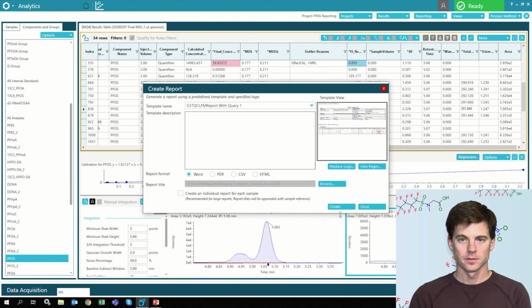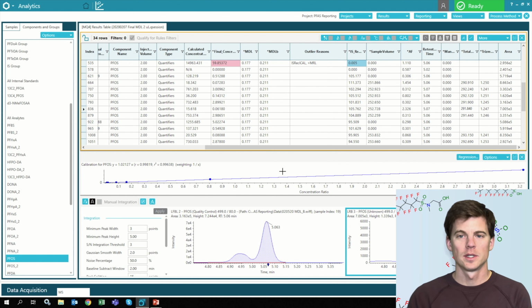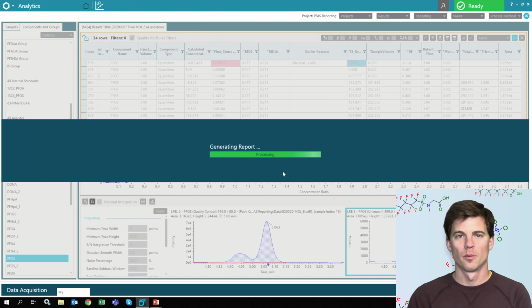And then again, anything in the batch that you typed in, anything calculated here can be pulled into further reports downstream. So I used a report template here. I just clicked create report with the previous template. You can have as many different templates as you want. This is a QA/QC template. So this is going to report out your CCCs, it's going to report out your matrix spikes, that sort of thing, and show all the flagging that you would need for your quality control samples.